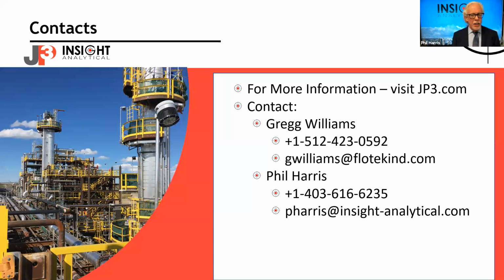Certainly, if it's sales-type gas or a gas processing line that's at pressure, we prefer to do it at pressure because it puts more molecules into the optical path, and you get a better measurement. The lower the pressure, the longer the path length cell we have to use, basically.